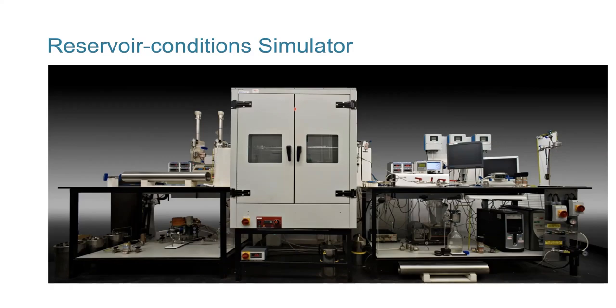Should I use water-based mud? Should I use oil-based mud? Do my completion fluid and drilling mud have any issue with each other in the reservoir? So we would simulate the reservoir operational sequence in this rig. You can see this side is what we call the reservoir side. We've got pistons where we can have oil inside the rig or outside the rig, depending on whether it's crude oil or refined oil. Humidifiers for gas wells. Typically, nitrogen is used for safety reasons.